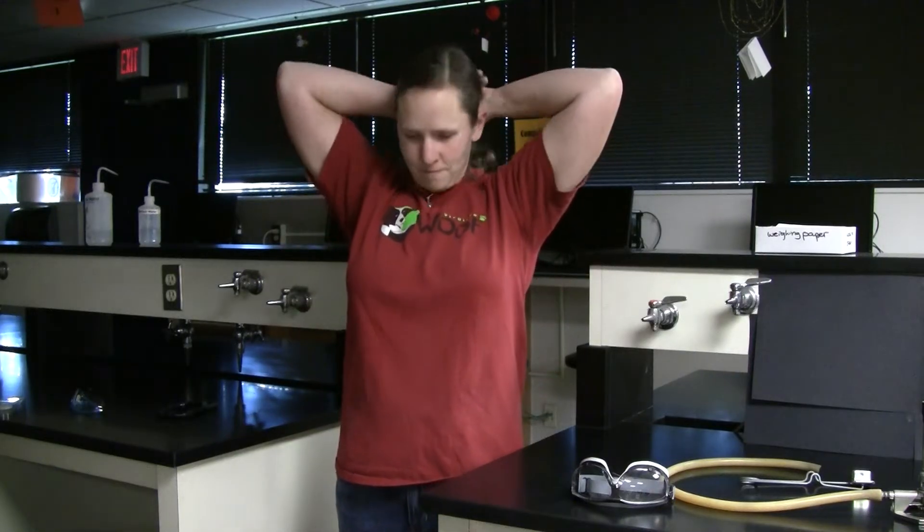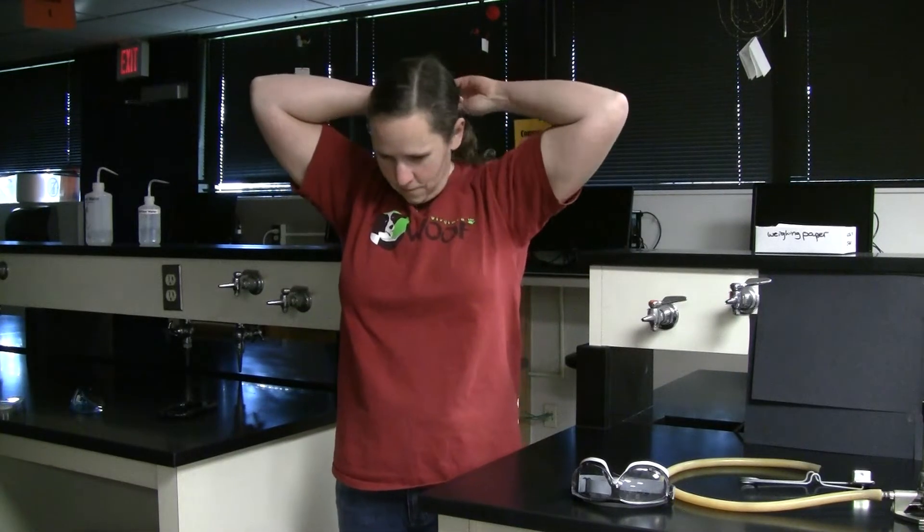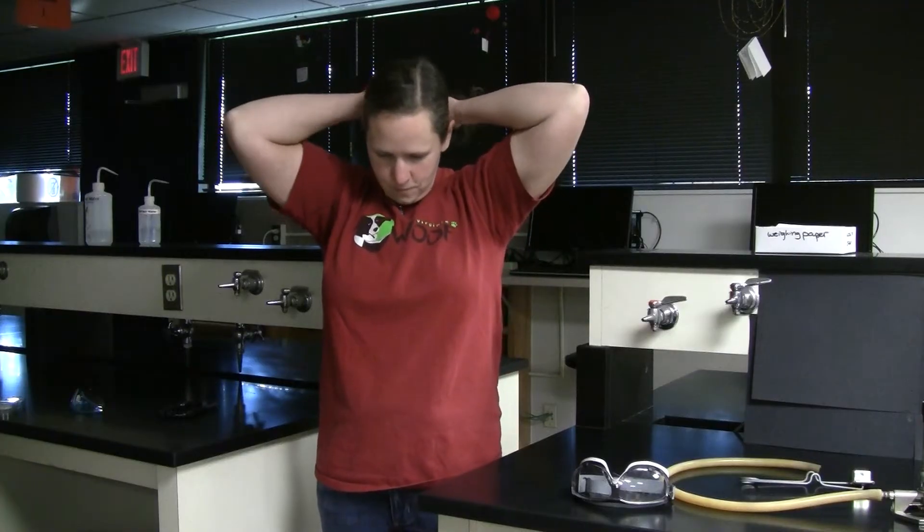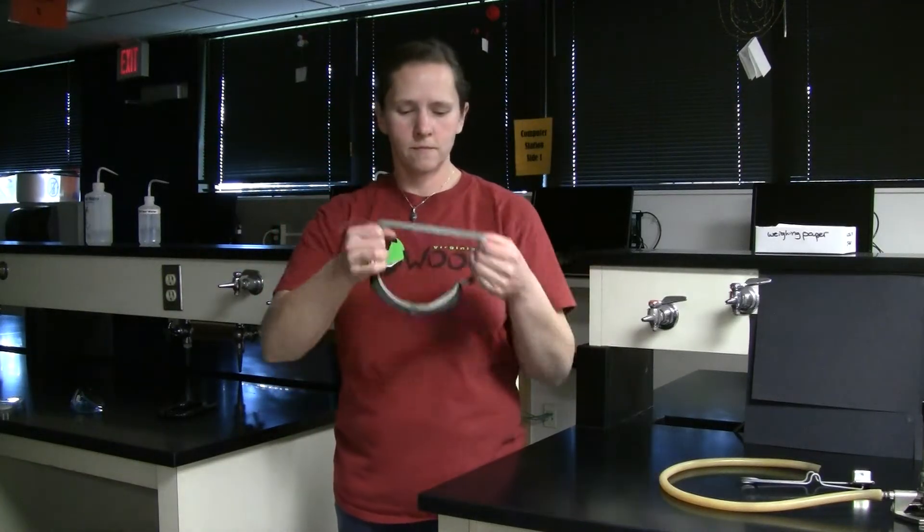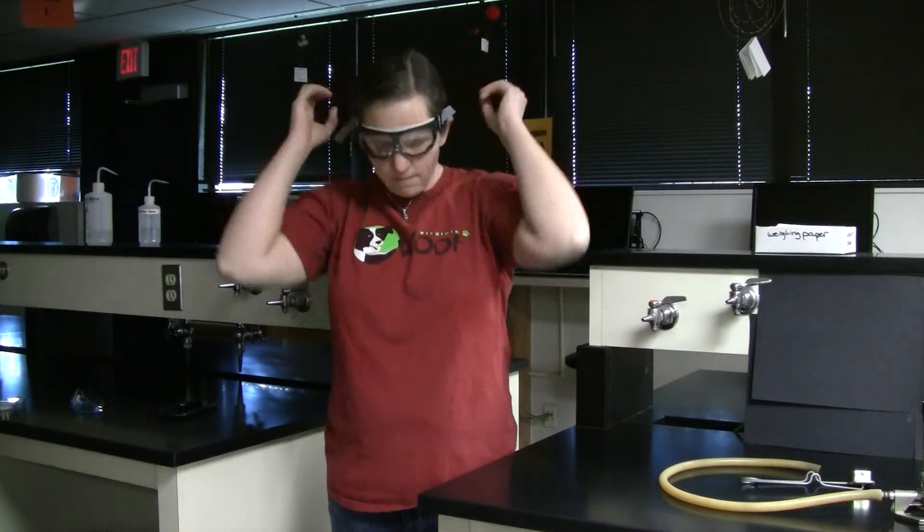You're in the chemistry lab. That means if you've got long hair, you should have that hair tied back and you should definitely have your goggles on. If you're wearing long sleeves or something that's loose, those sleeves should either be rolled back or pulled back as well.